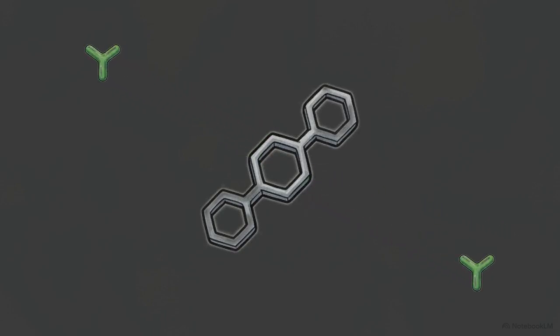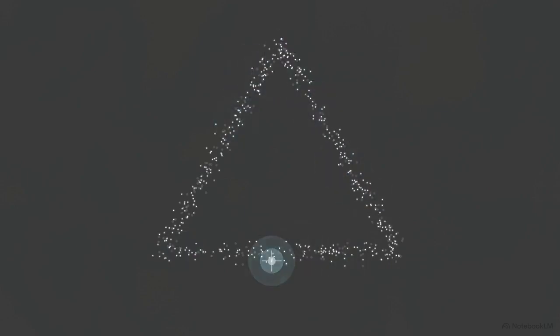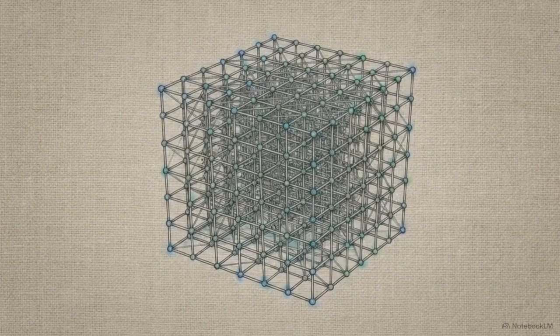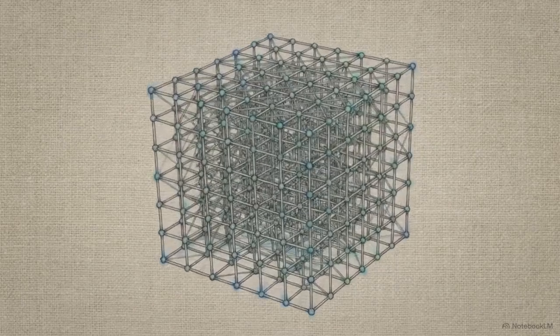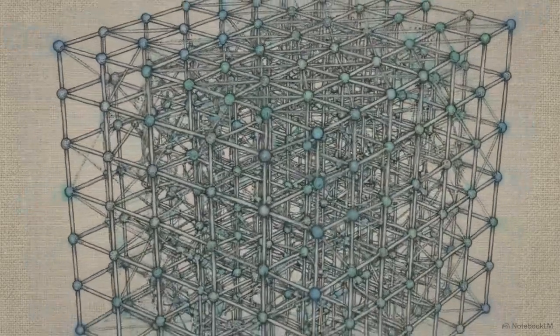This creates a stochastic blinking mechanism. The system ensures only a sparse, random subset of molecules emits light. Because flashes are separated by dark space, algorithms map their point spread functions. Software calculates the exact center of each emission, constructing a precise sub-diffraction image. This process transforms a physical optical blur into a precise, navigable mathematical coordinate map down to 5 nanometers.